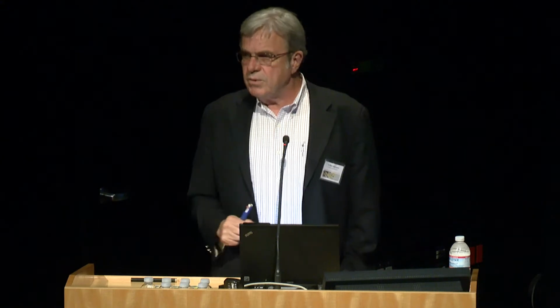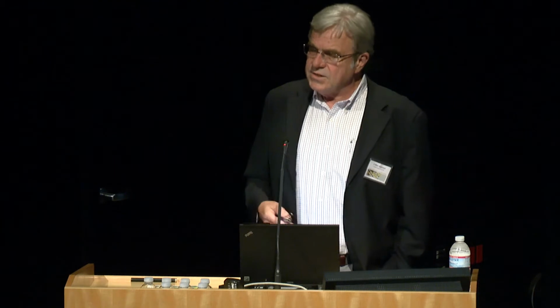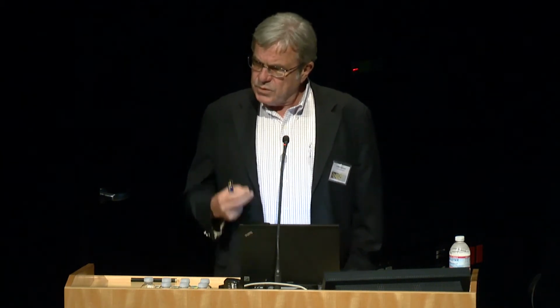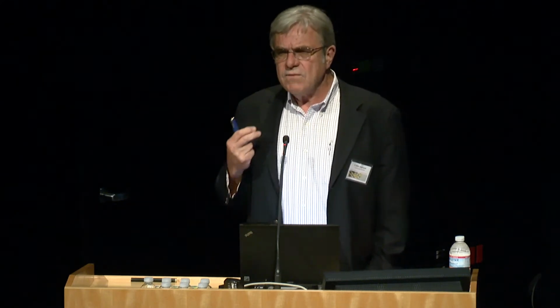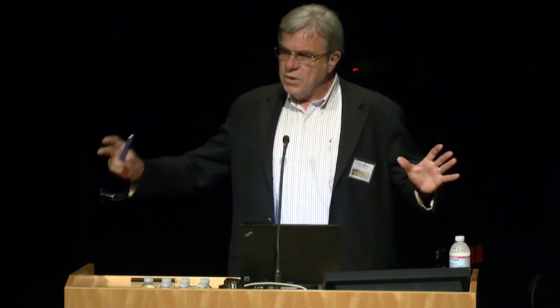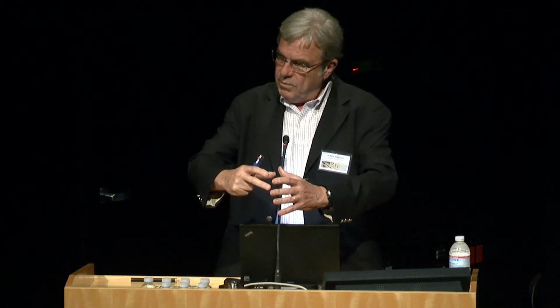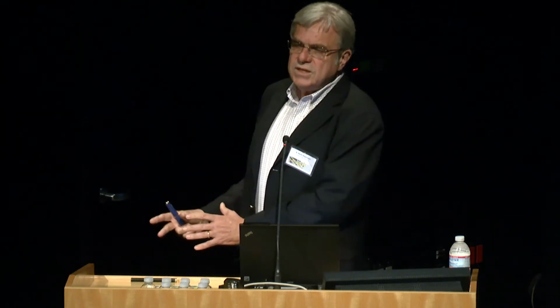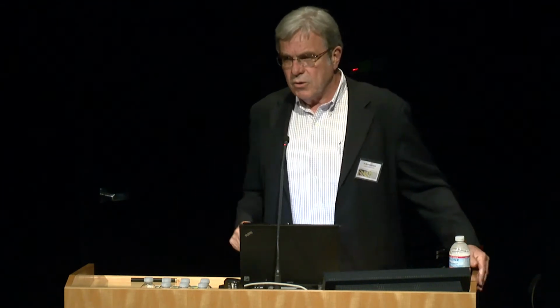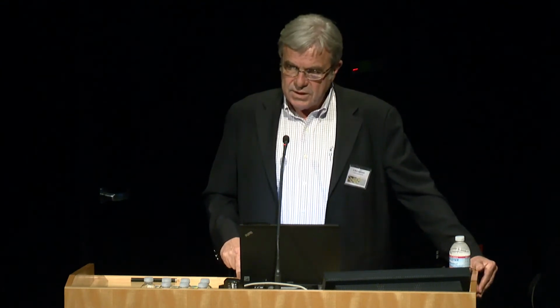We've surveyed multiple molecules in the brain. The only compound in the brain that we found that has a cyclic voltammogram that looks like this is norepinephrine. Norepinephrine's a molecule which has a very similar structure. But to distinguish norepinephrine from dopamine, we take advantage of the fact that certain regions of the brain use dopamine as a neurotransmitter, other regions use norepinephrine, and so by our anatomical placement, we use that as well to help us in knowing exactly what neurotransmitter we're looking at.